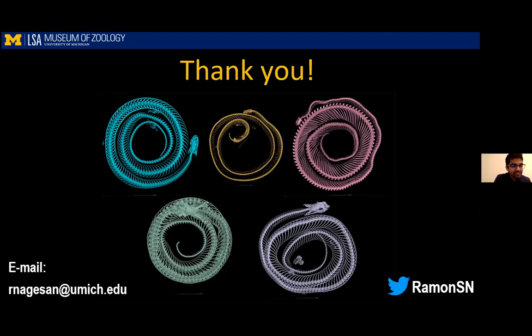Is it possible to scan spiders, and how would you prepare this material? It should be possible to scan a spider. From what I have seen, interestingly, with insects, you can get a lot more information from just a very short 15-minute scan of an insect than you can of a vertebrate. There's a lot more harder structures inside, and I've actually seen musculature come out of insects just from a non-DiceCT scan, what would be equivalent to a skeletal scan.